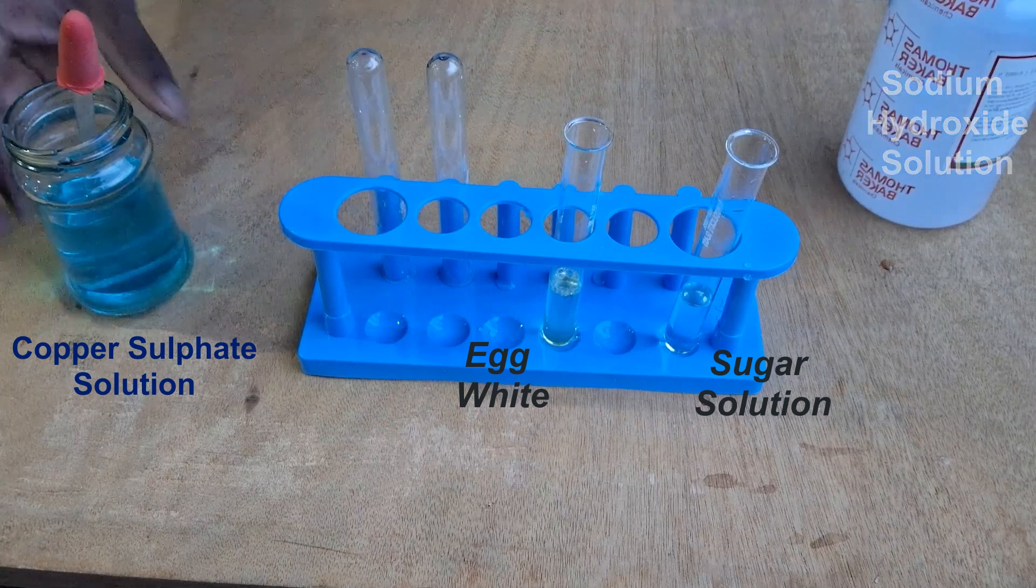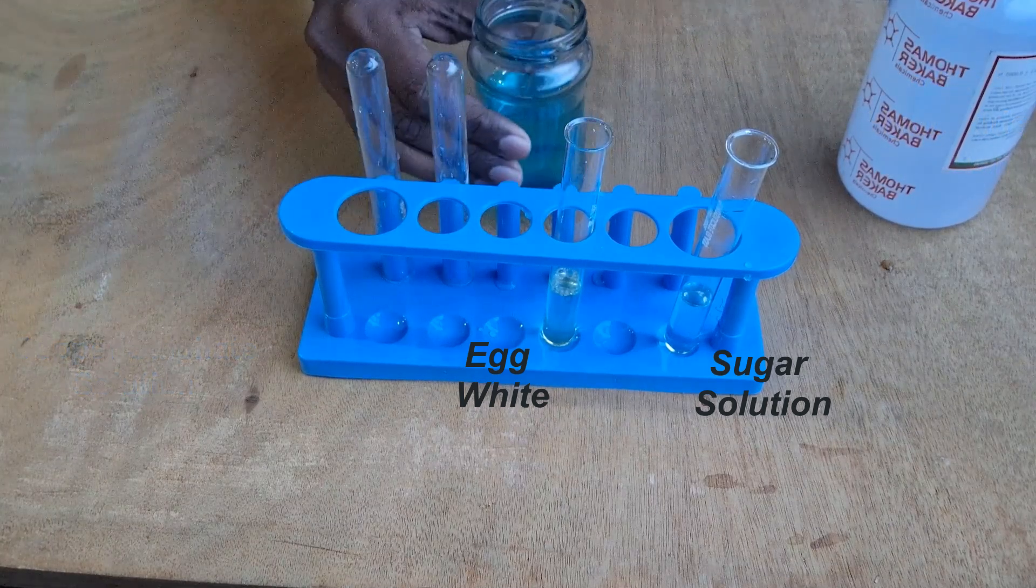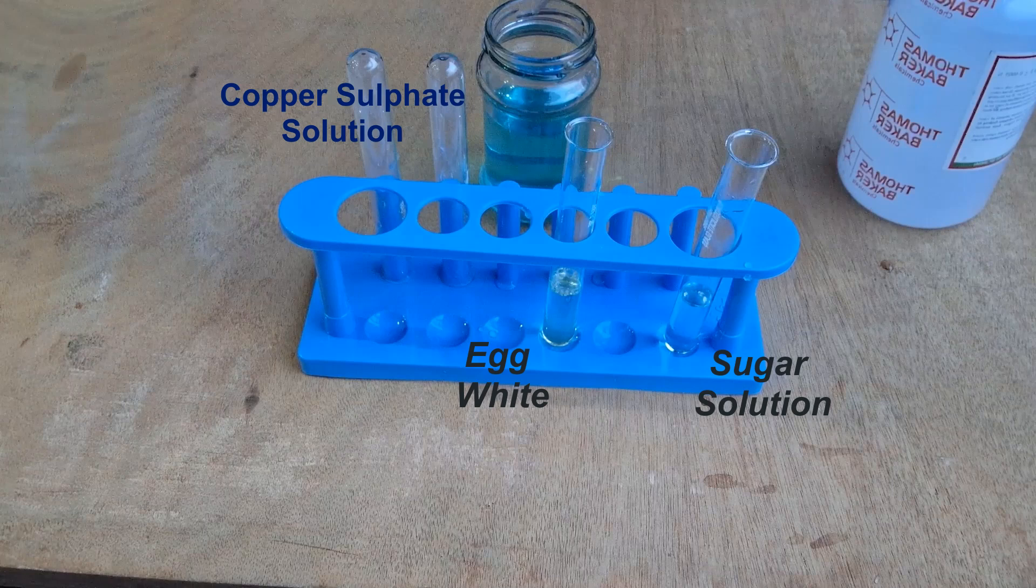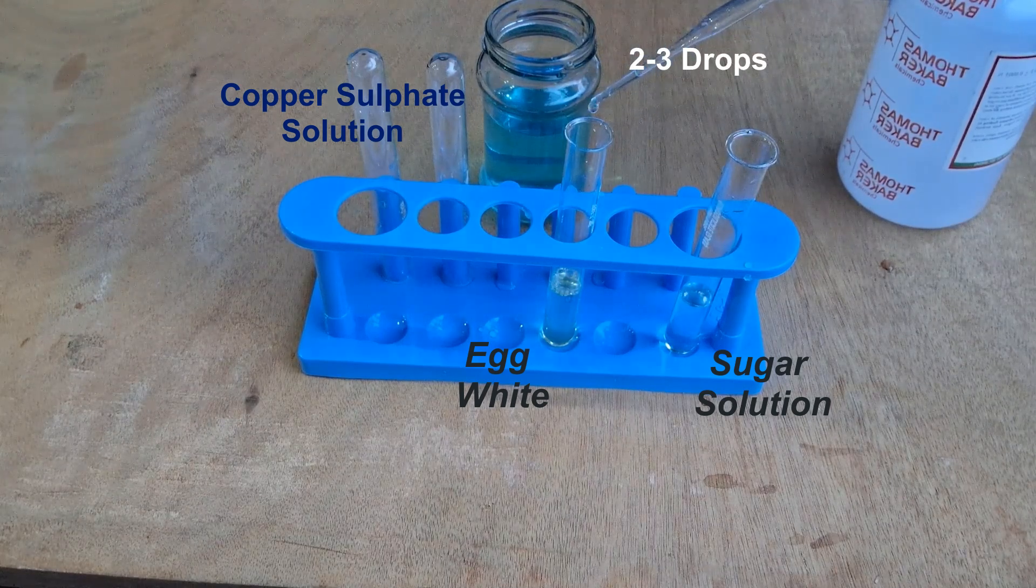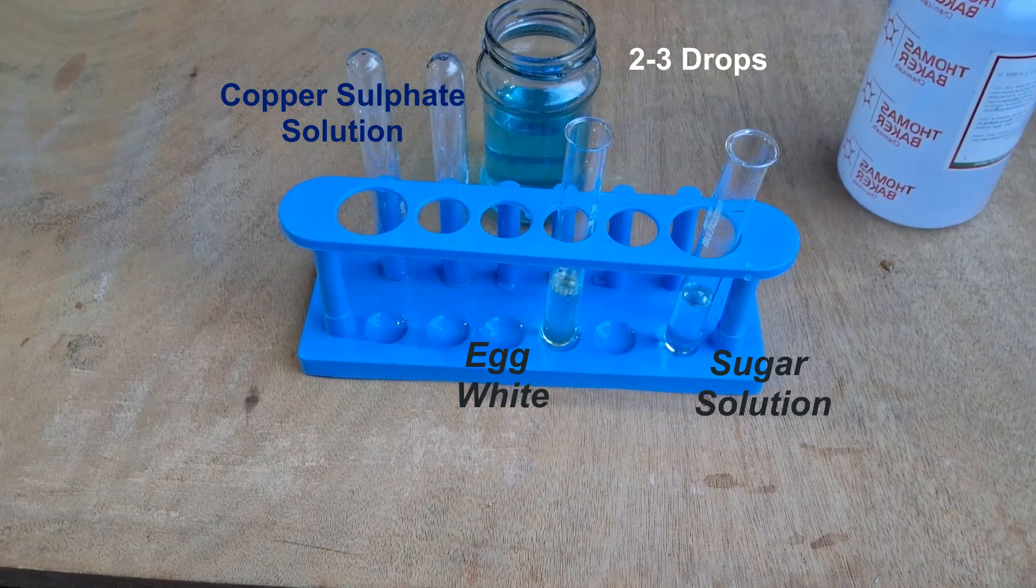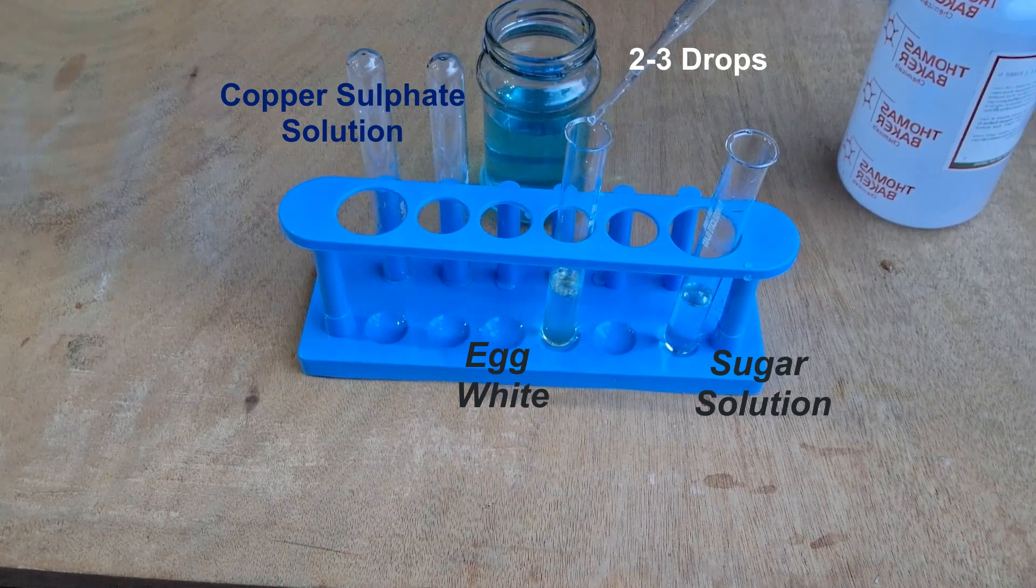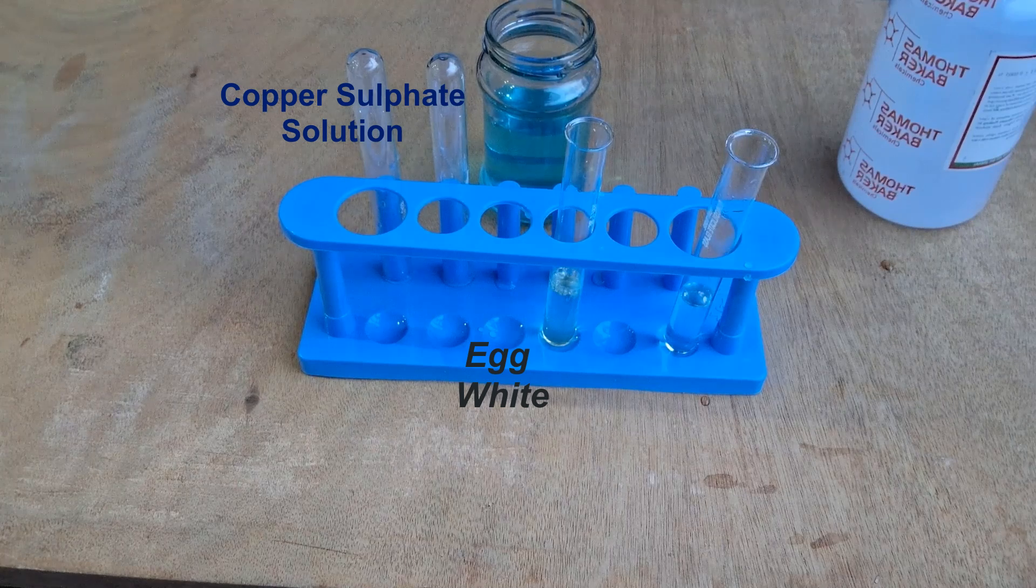Now we'll take copper sulfate solution using the dropper. I'll carefully put in two or three drops of copper sulfate solution into the test tube that contains egg whites. Don't put too much copper sulfate solution.